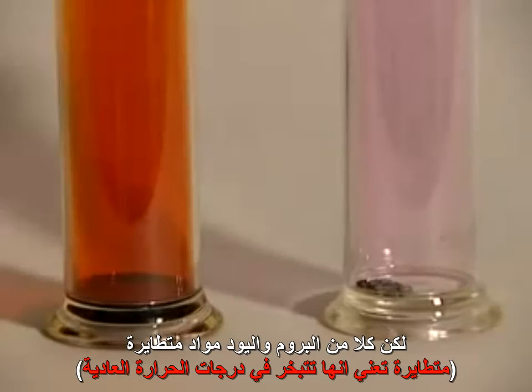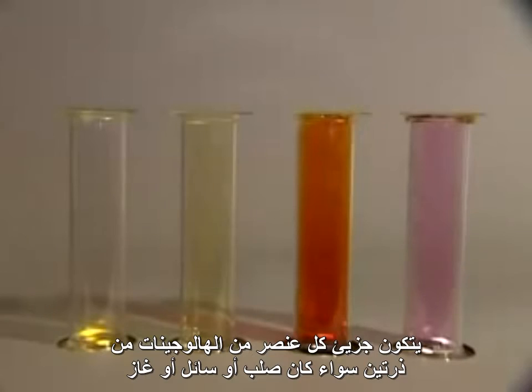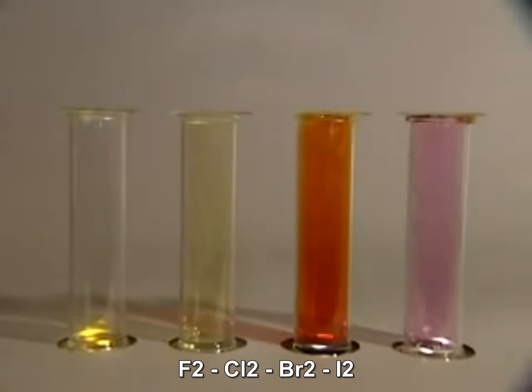Even so, they're both quite volatile. You can see the coloured vapours, orange-red above the liquid bromine and purple above the solid iodine. Whether solid, liquid or gas, the halogen elements consist of diatomic molecules: F2, Cl2, Br2 and I2.